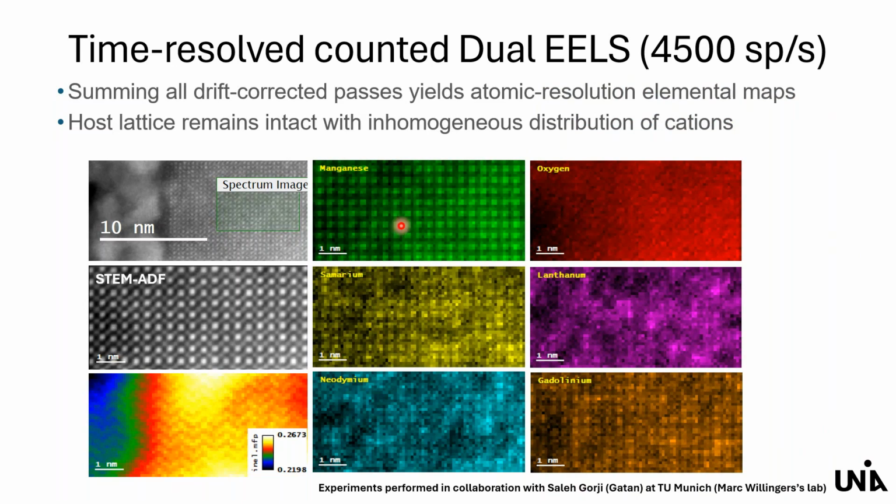That's also quite important. And this result is then consistent with the stationary random and locally resolvable cation distribution expected for these high entropy solid materials that we have as a sample here.